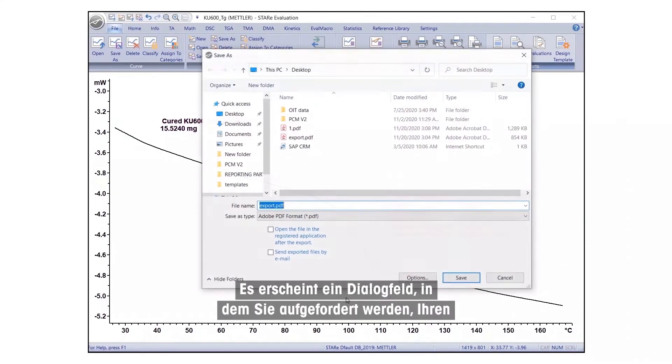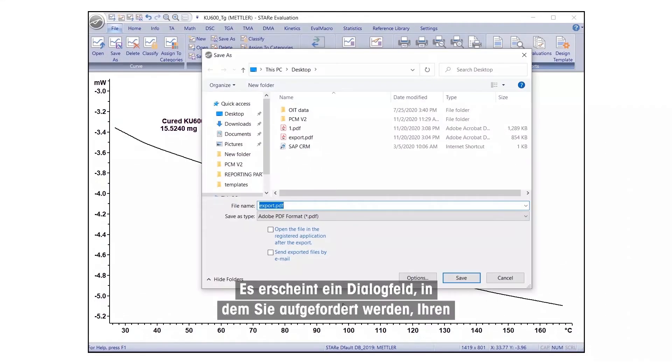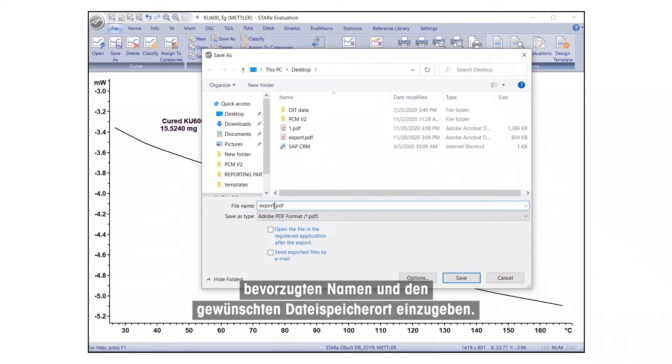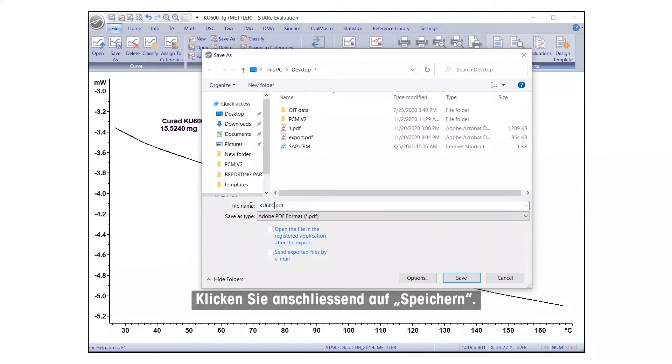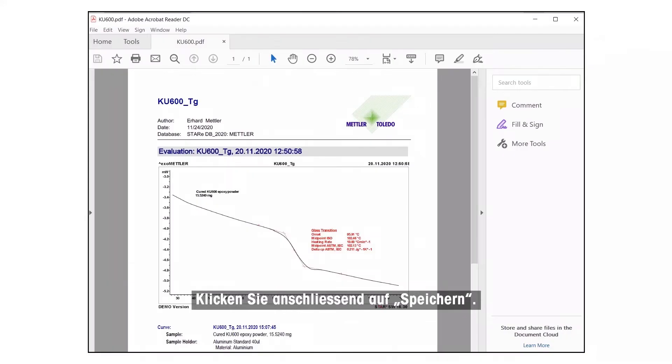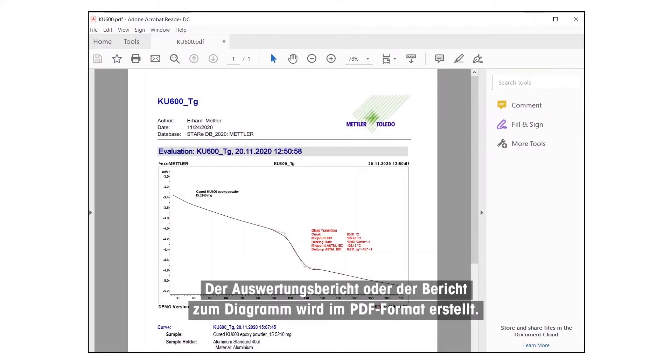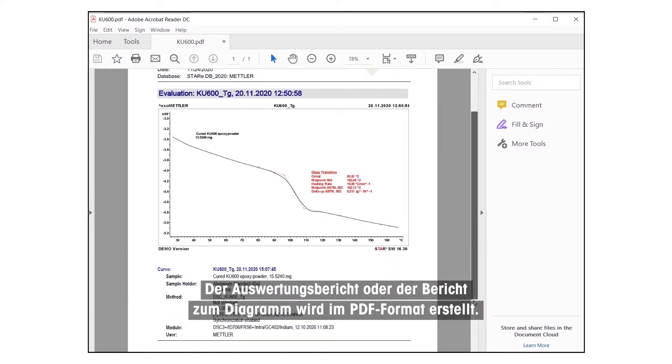A dialog box will appear, prompting you to insert your preferred name and location where the file should be saved. Once done, click Save. The report of the evaluation or plot will be generated in PDF format.